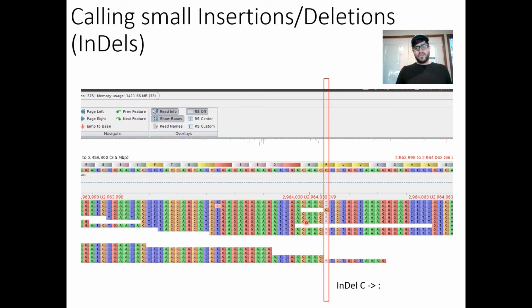So in general, when we're doing a lot of downstream analyses, at least using Illumina data, we are not going to be using indels for a lot of things. And then what's also kind of interesting to note here is that at this position, you can see all the reads are a T, and then we have the single read here that's a G. And so this would correspond to an actual error in the Illumina read.